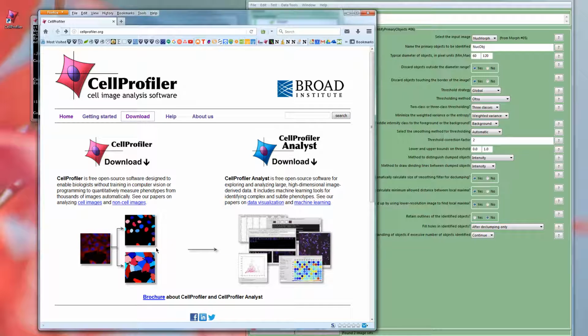There's a bunch of things you may want to just stick to Fiji. It's a little bit easier to do the one-off functions, but for when you want to do repeated tasks and you want to analyze lots of data that's similar, you can do it a lot quicker and get a lot more information, and with a much better segmentation using CellProfiler.